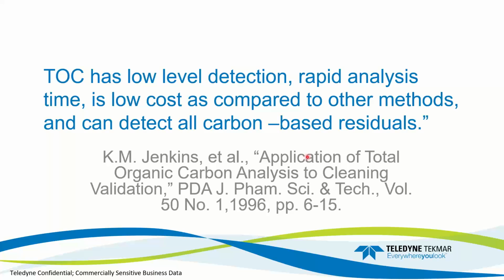This is a publication right here. TOC has a low-level detection, rapid analysis time, is low cost compared to other methods and can detect all carbon-based residues. This is a great application. This is a great paper. So if you can, go out, read it, and it allows you to understand a little bit more about the use of TOC in the pharmaceutical process.